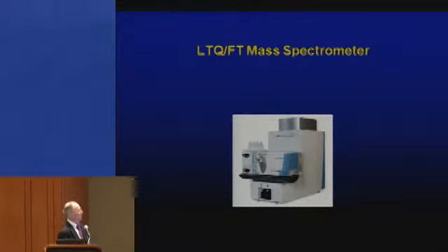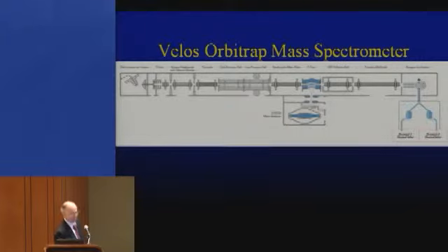I didn't have an Orbitrap. I had the Fourier transform instrument in my lab, and so we decided that the best choice would be to modify the instrument so that you would have the electron transfer dissociation being introduced and negative ions being introduced on the same side as you do the electrospray. Unfortunately, my student Josh Kuhn decided that he would go build the Orbitrap instrument and introduce everything from the back end, which I think was a big mistake.